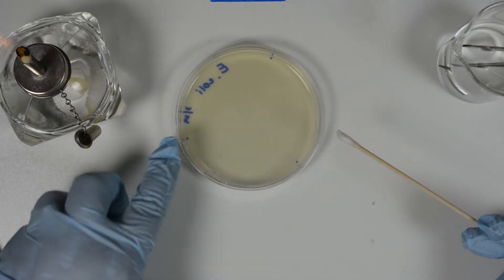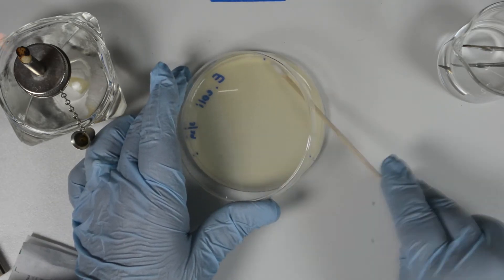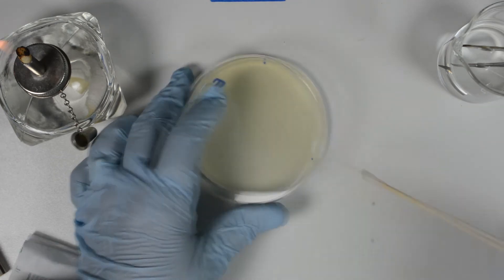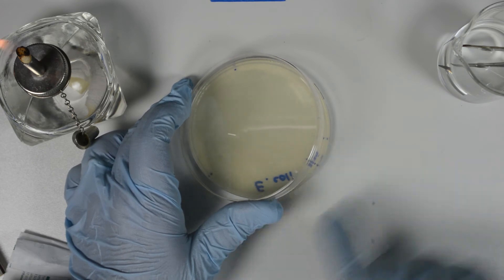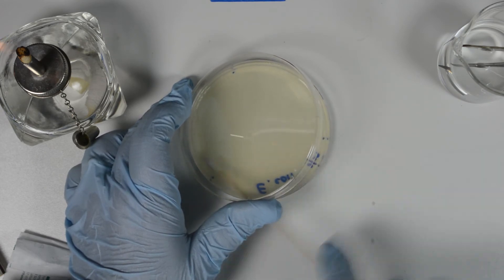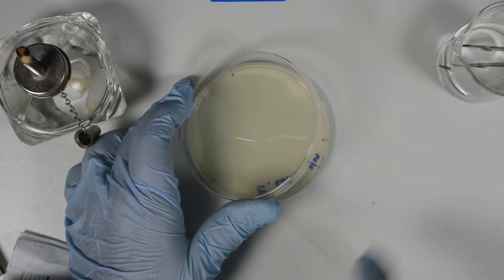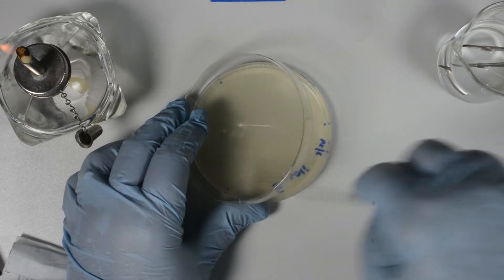Rotate the plate one third of a turn. Cover the surface of the agar as evenly as possible, just like before, keeping the lid as a shield. Rotate the plate another third of a turn and cover the surface of the agar as evenly as possible. Then run the swab around the edges to remove any excess liquid. Discard the swab into the biohazard container.